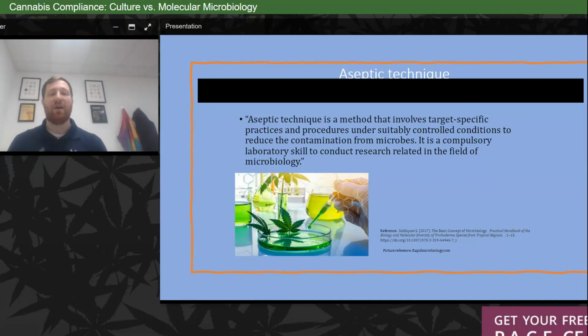Nowadays, with the broad amount of one-time use objects that are already sterile, we can autoclave, and also wipe down the benches with IPA, isopropyl alcohol, and a 10% bleach. I always say that you should alternate, just to make sure that we're not building up any sort of resistance that can occur.